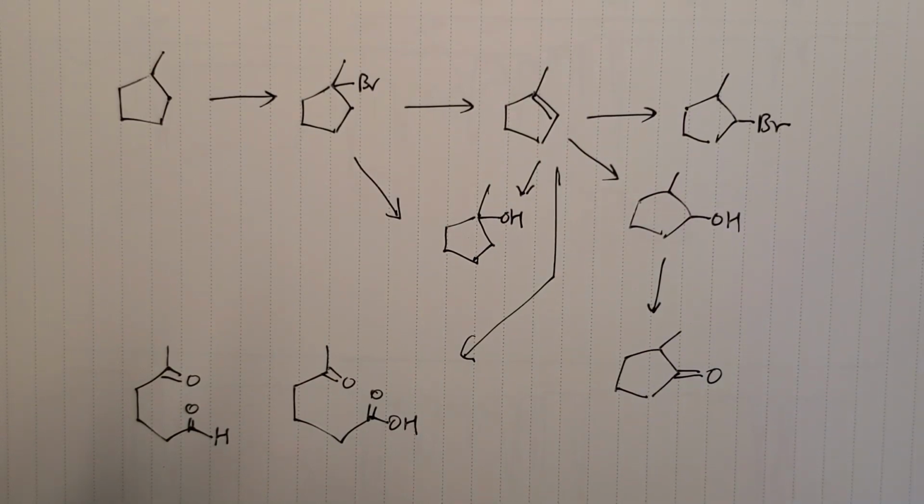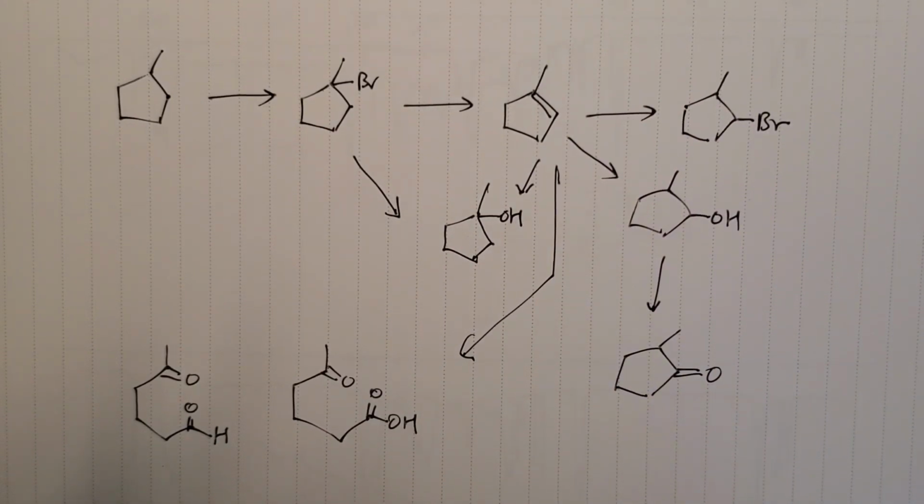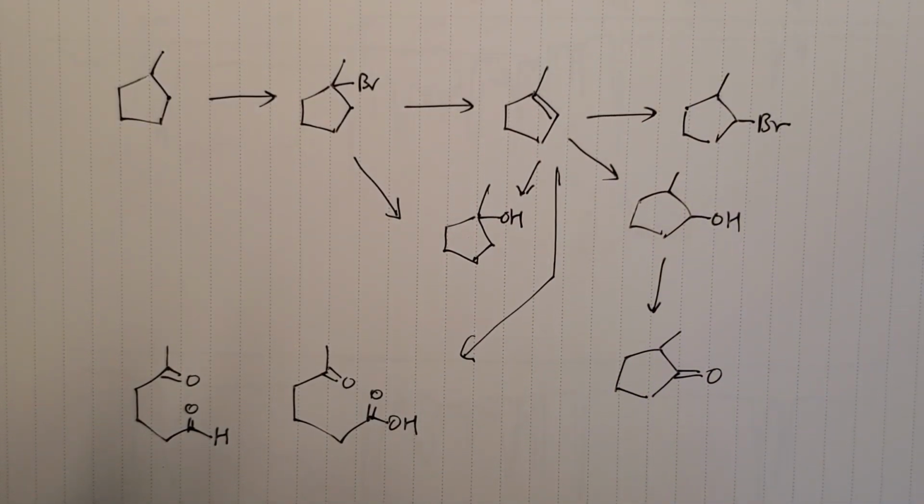But I want to touch upon carbonyl groups. And in our lesson, what we have left is learning more reactions on alcohols and ketone, aldehyde and carboxylic acid, or the ester out of the alcohol or the carboxylic acid, amides, and those things. So let's give more attention to the carbonyl, and you can get more sophisticated little changes giving good information for structure. You can catch that with it.